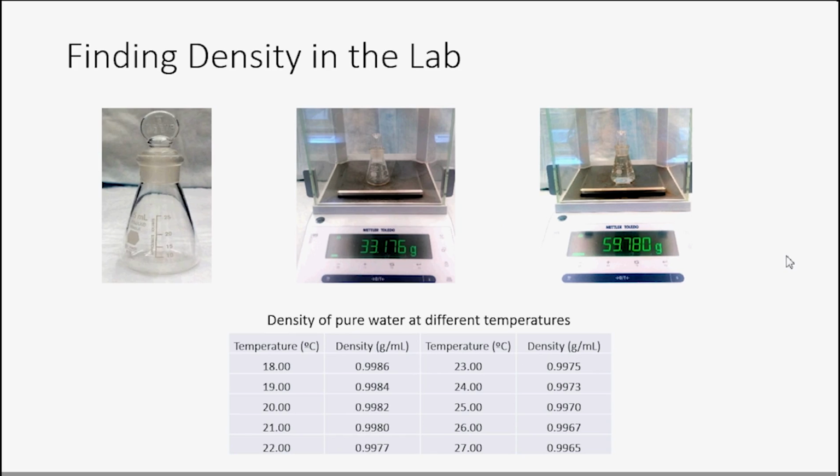In order to make volume measurements in this experiment more accurate, you will determine the exact volume of a 25 milliliter Erlenmeyer flask with a ground glass stopper. Note that the exact volume will not be 25.00 milliliters. Once the exact volume of this container is determined, it can be filled with other solutions to that exact volume.